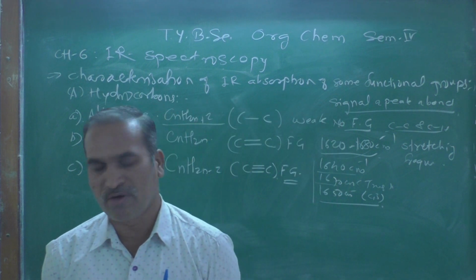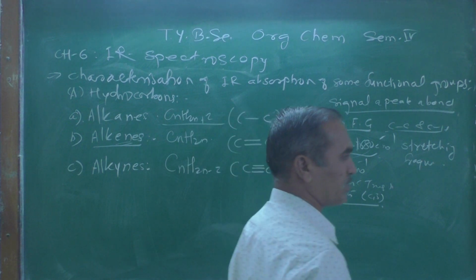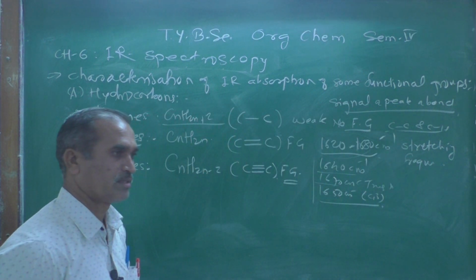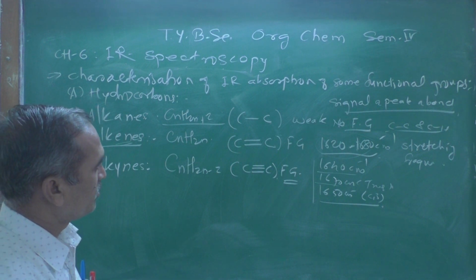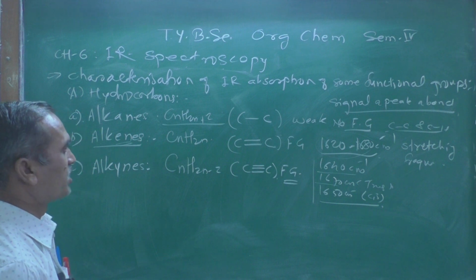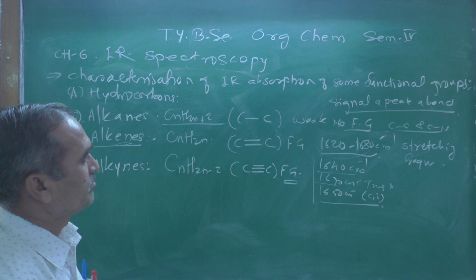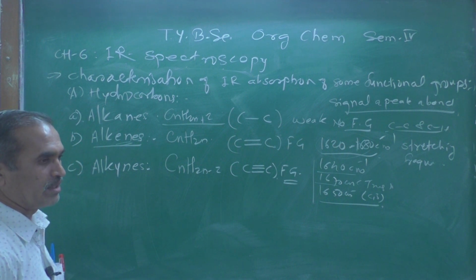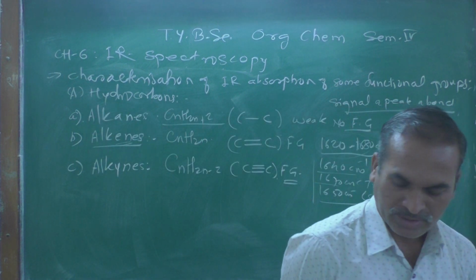Without the knowledge of chemistry, you cannot analyze, you cannot interpret the spectra. So the training is needed. Generally, an organic chemist can identify and recognize what the peak is due to.